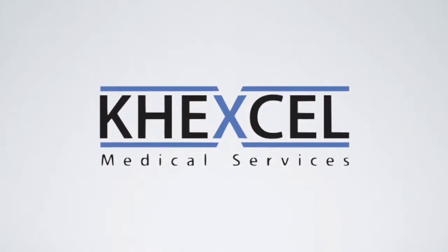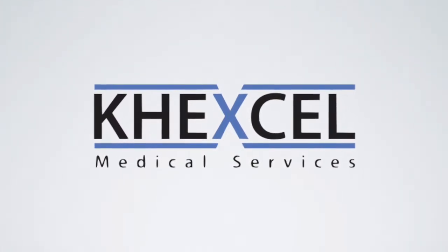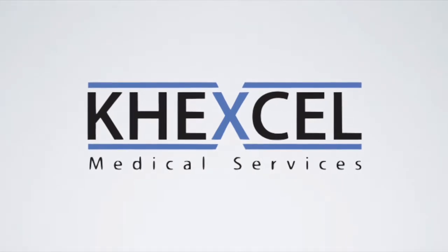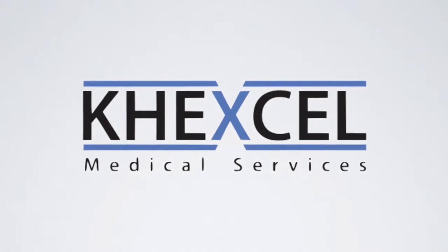Hi there, today we're going to be doing a short tutorial on how to set up and calibrate your KM1001 micro syringe pump.